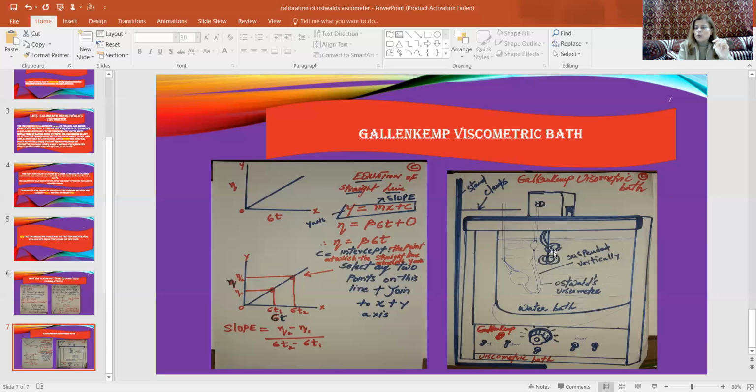It has got these electronic coils because, of course, it's a thermostatic water bath, so it is regulated by electricity. Now here you can see this minute drawing. Oh yeah, it's so beautiful. This is the Viscometer. It has got these marks, and just keep in your mind the level of the water. You just see the water level, right? The Viscometer is supposed to be dipped inside, I mean, its bulbs are supposed to be immersed inside this water level, right? You keep that in your mind.